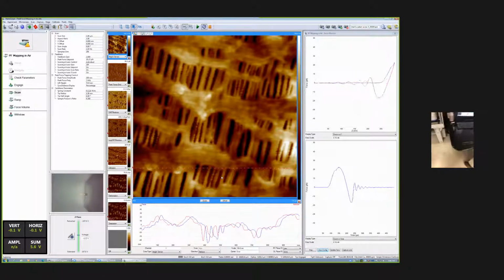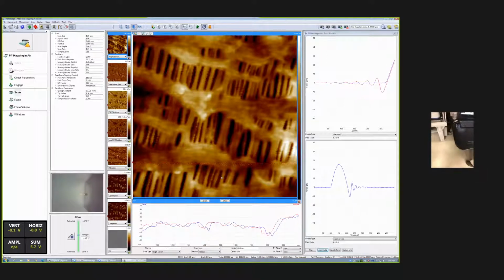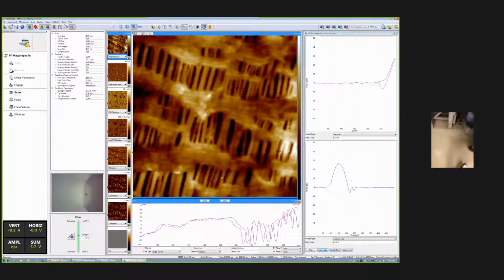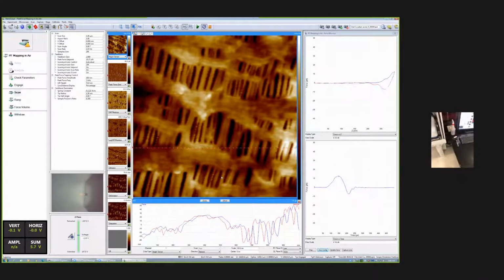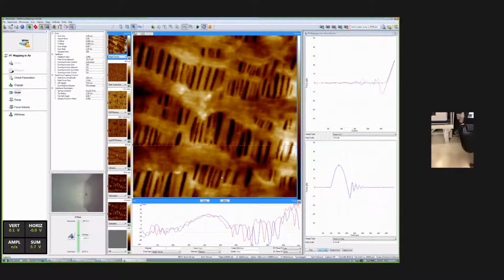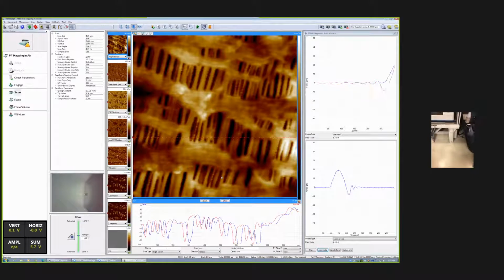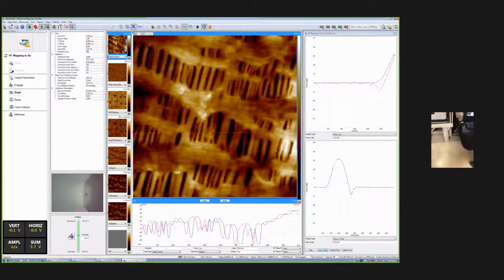Similarly, if you put it into an optical microscope, it's opaque. The advanced stuff that Mike was showing before generally relies on the sample being transparent. This is an opaque sample, so it doesn't work so well. And then, independent of that, even though these features in the XY plane are quite small, in the Z dimension, we wouldn't really have the ability to measure that information. So structurally, it's interesting.